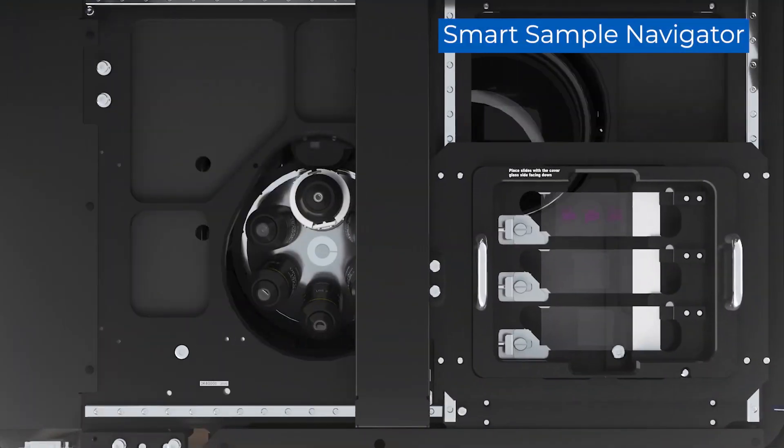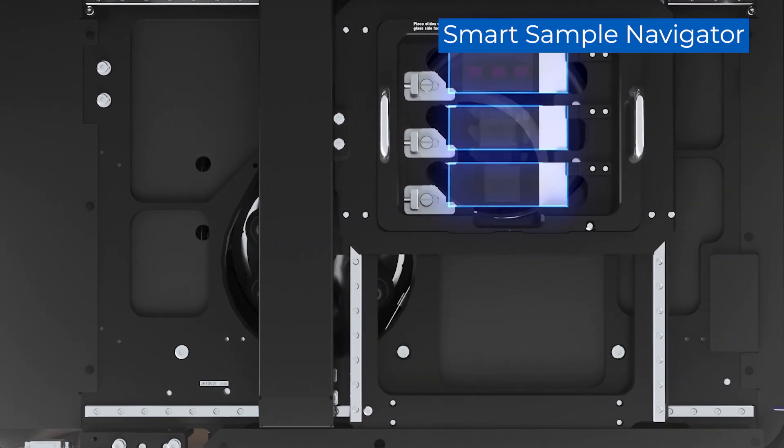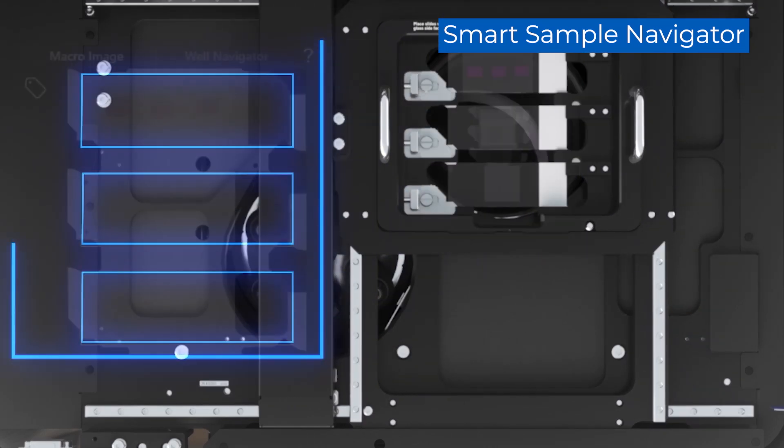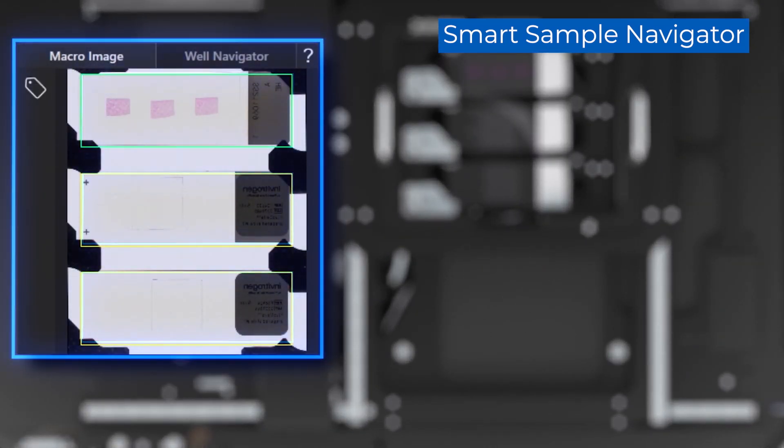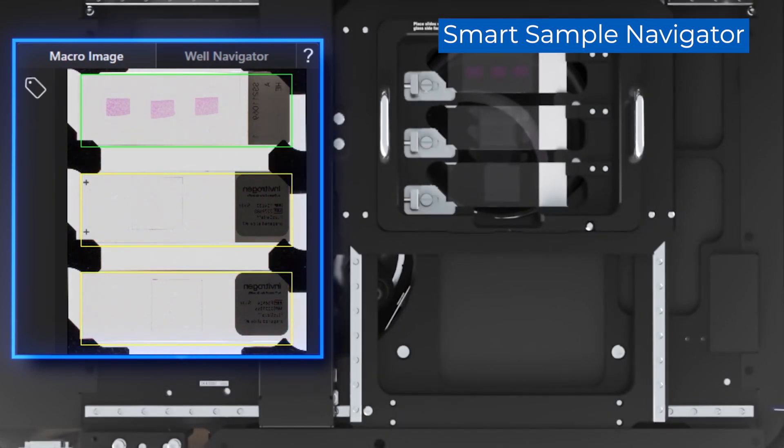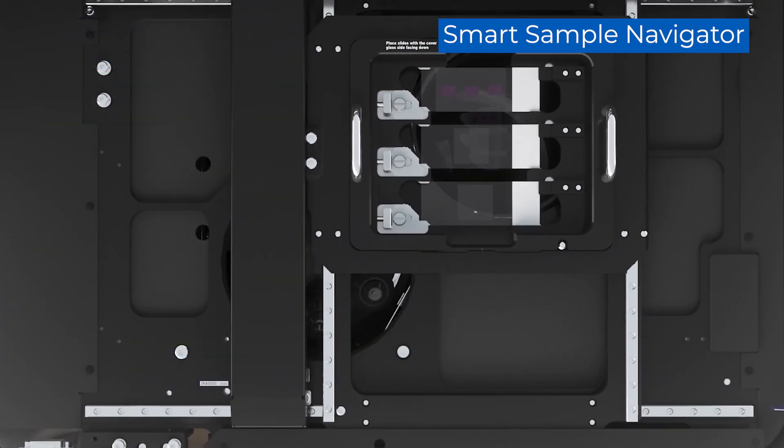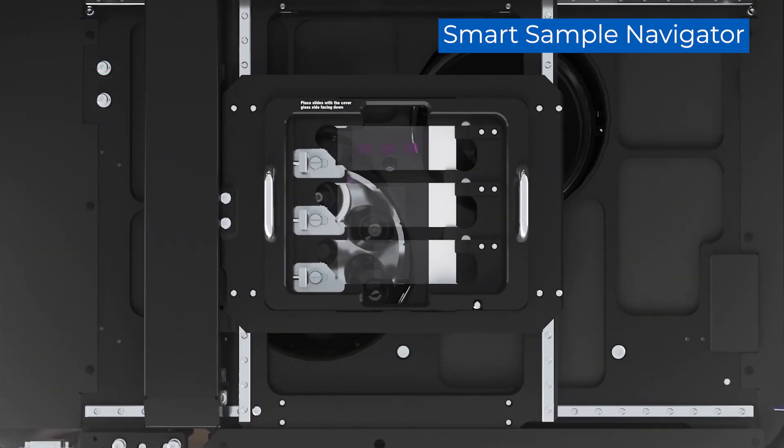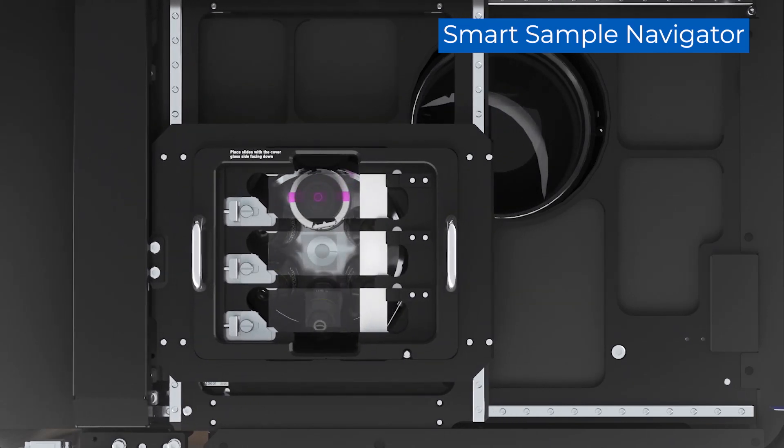The Smart Sample Navigator uses a macro camera and AI-based sample detection technology to automate the initial sample search, allowing you to visualize and explore your sample within about 10 seconds of setting it into the microscope.